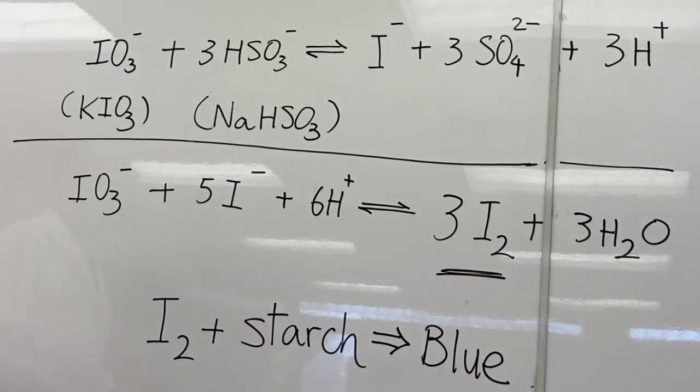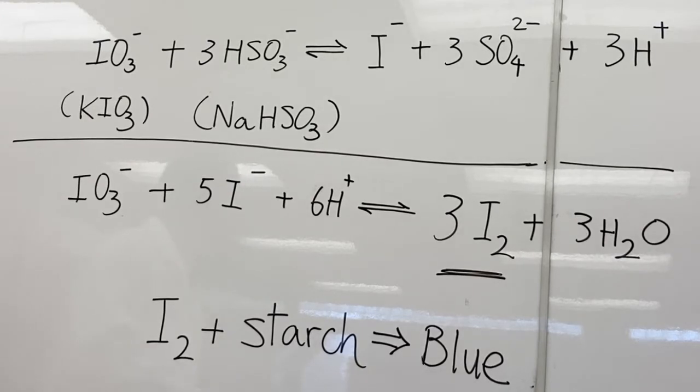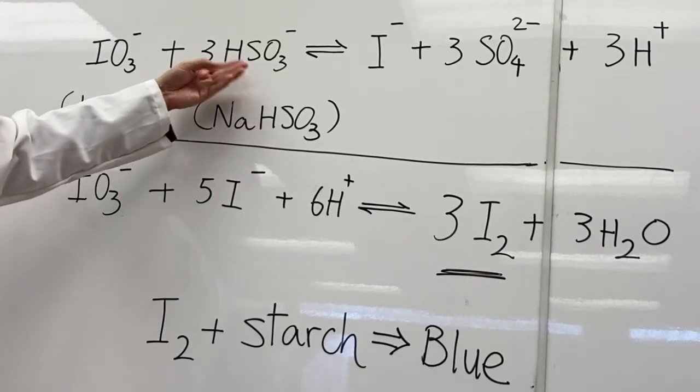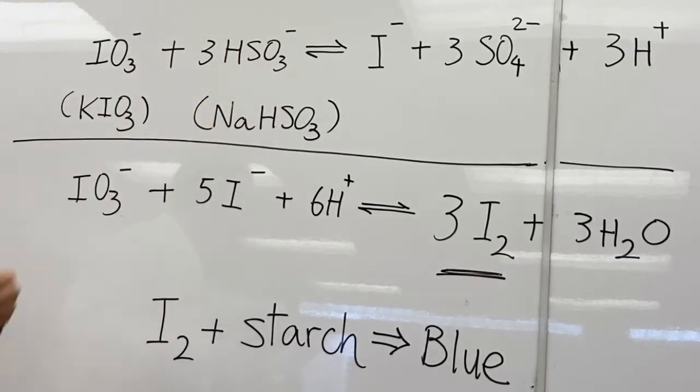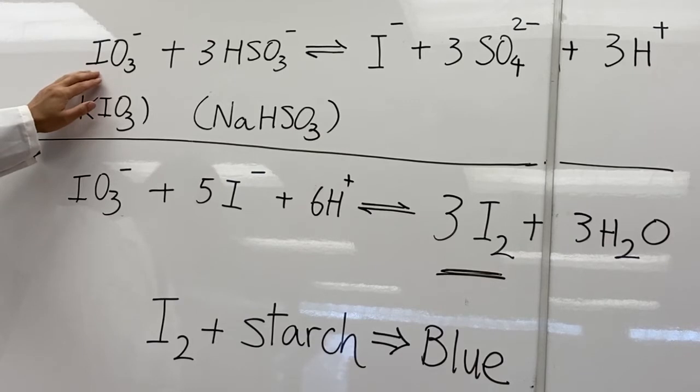So in this experiment, we are going to perform 3 separate reactions. Each one of these will use the same amount of hydrogen sulfite.